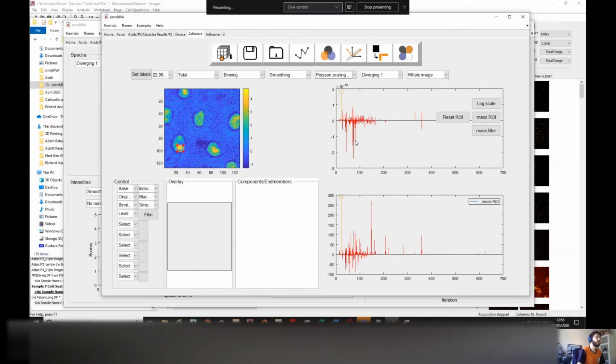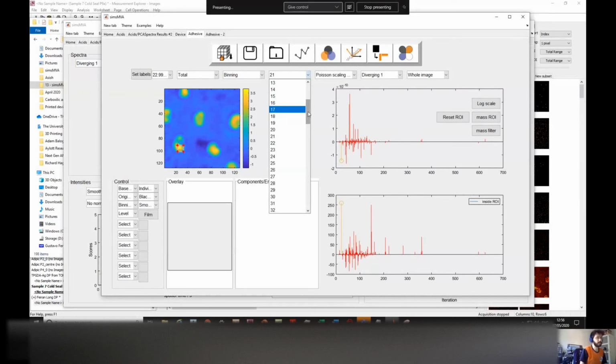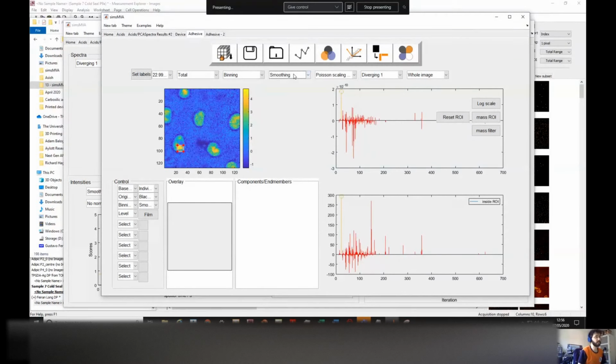You do, but it's more related to the spatial resolution, because the idea of smoothing is averaging as well. Instead of binning, where you're joining pixels together, it's almost like averaging pixels together, but without getting rid of the neighbors. For each pixel, you take the 4 neighbors around it and average the number. That's why it blurs, because you're mixing the signal. The expectation is that because noise is random, you cancel the noise. So in a way, you're improving the signal to noise ratio, but not necessarily improving the counts per pixel, and most certainly decreasing your spatial resolution because you're moving it. So yes, there are good sides, but you have to be careful.